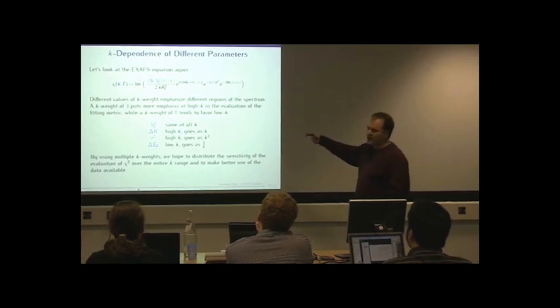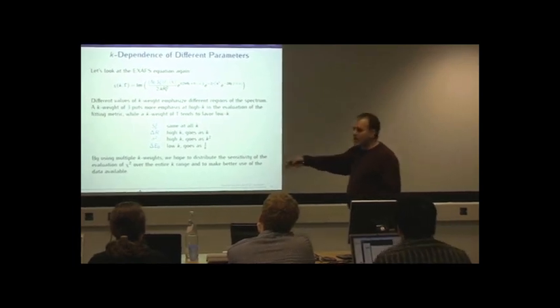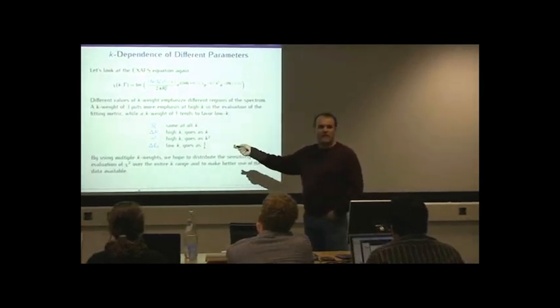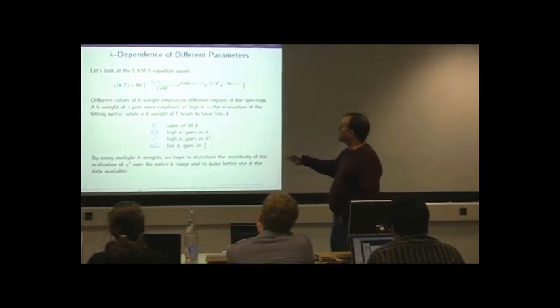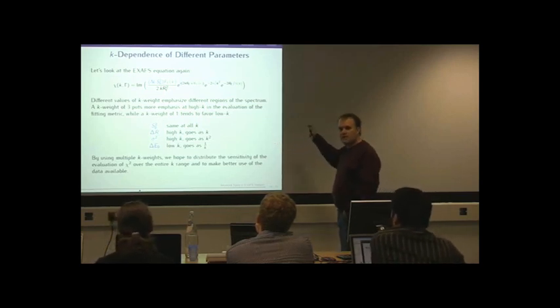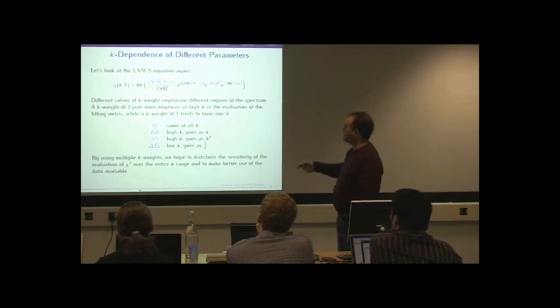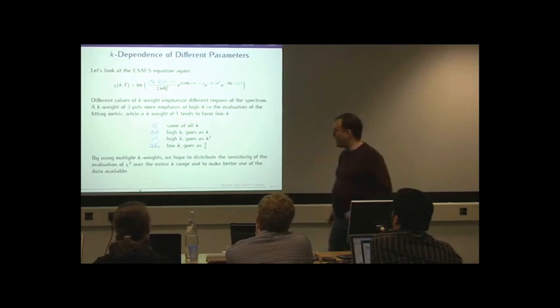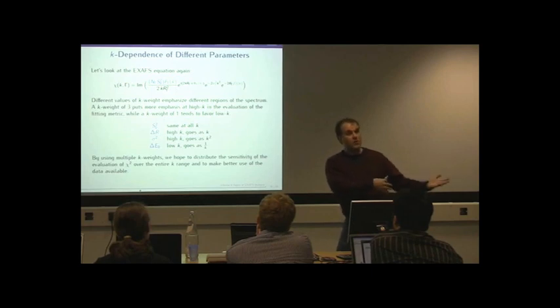However, at low k, the wrong value of sigma squared has a much smaller effect on the data. Similarly, delta r, since r is multiplied by k, if it's the wrong number, it contributes more misfit at high k. Contrary-wise, delta E naught, a mistake in the shift to line up the k grids, is a bigger problem at low k. It contributes more misfit at low k than at high k.